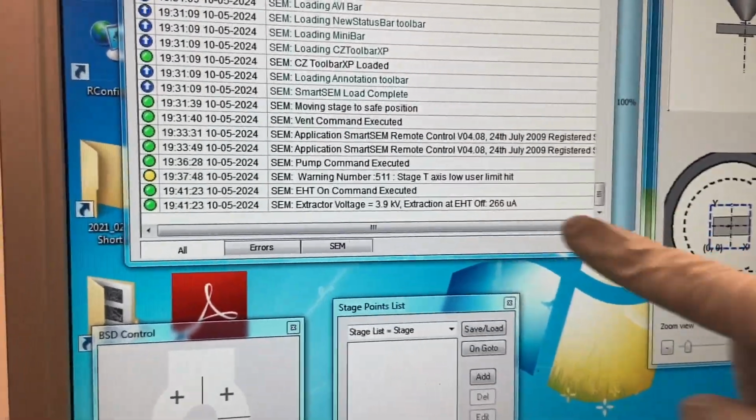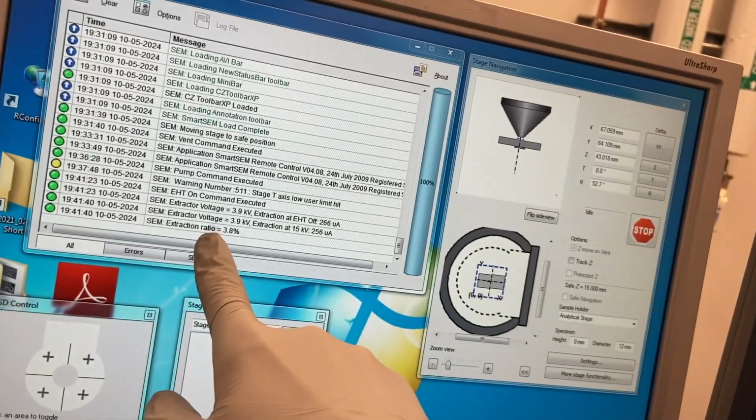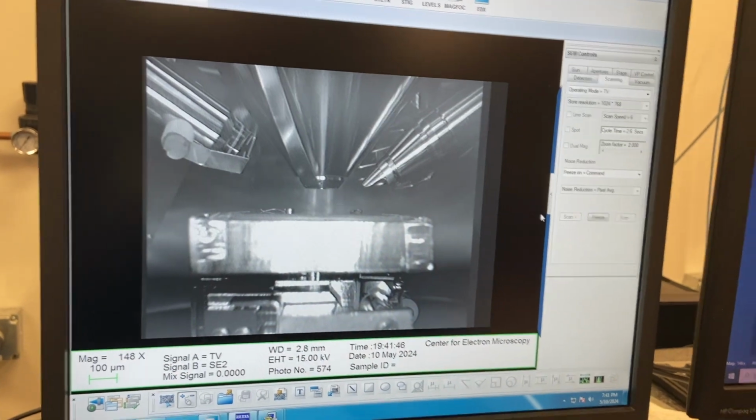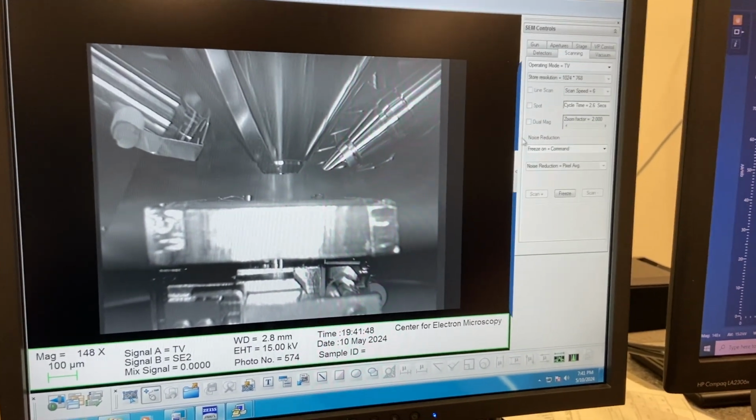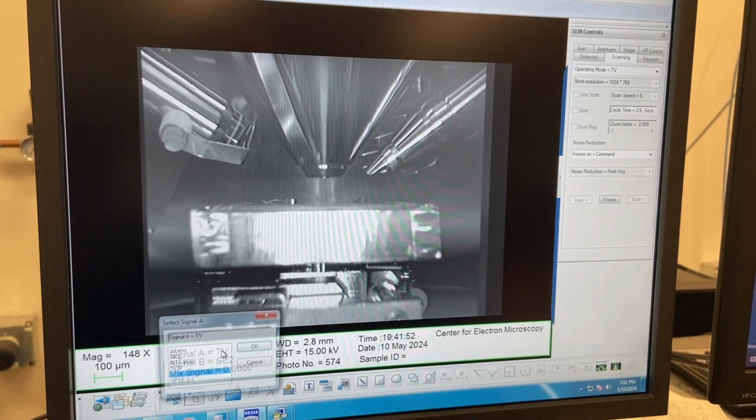Yeah, see here, I reached the tilt control limit. So when I was moving this, I kind of tilted it a bit, but it's now back to 0, so we're good. And then this is essentially the beam. So now we're getting interactions. You can't see it on here because obviously not with this sort of a view, but let me show you an angle where we can see the interactions.